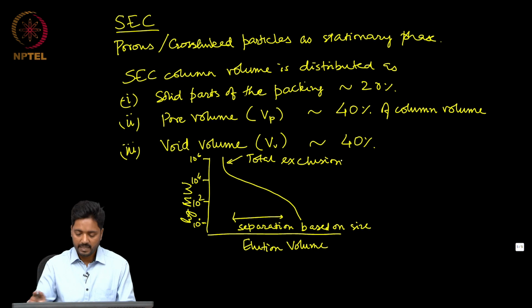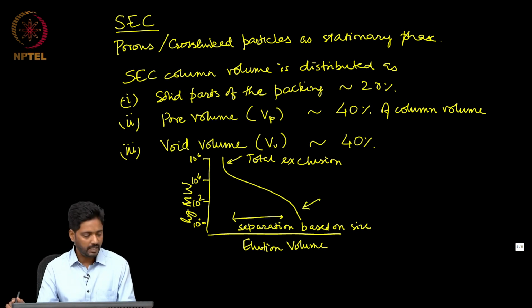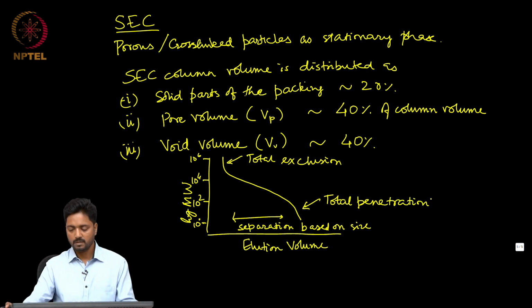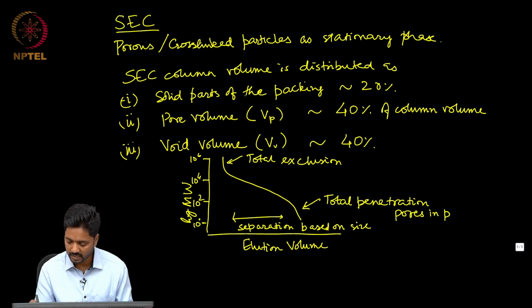Similarly, at the other end, we have what is known as the total penetration, where the protein or the macromolecule penetrates all the pores present in the particles.